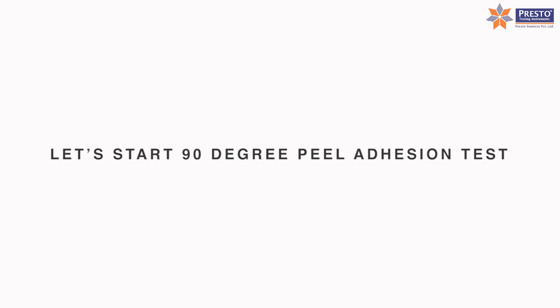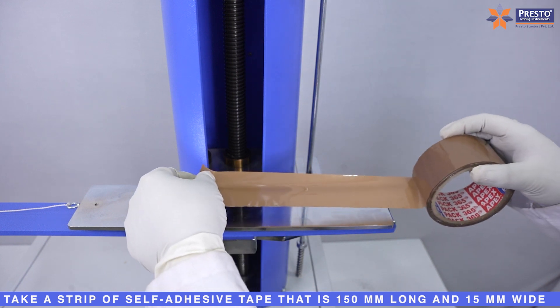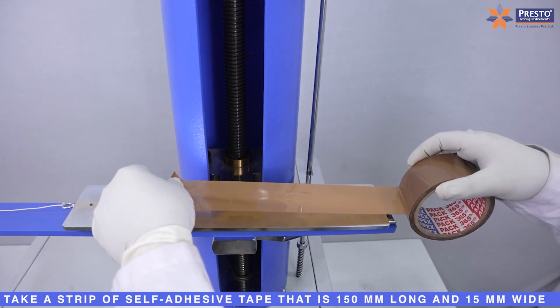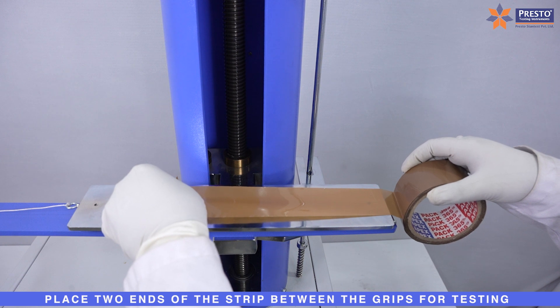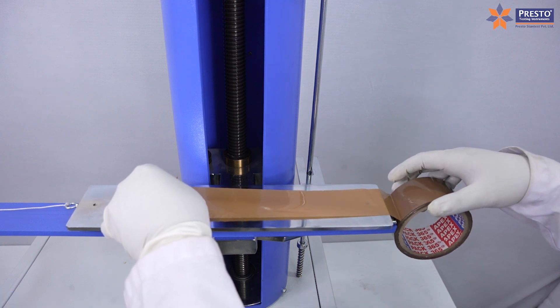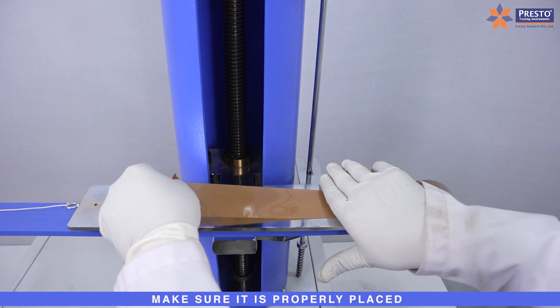Let's start the 90 Degree Peel Adhesion Test. Take a strip of self-adhesive tape that is 150mm long and 15mm wide. Place two ends of the strip between the grips for testing, and make sure it is properly placed.